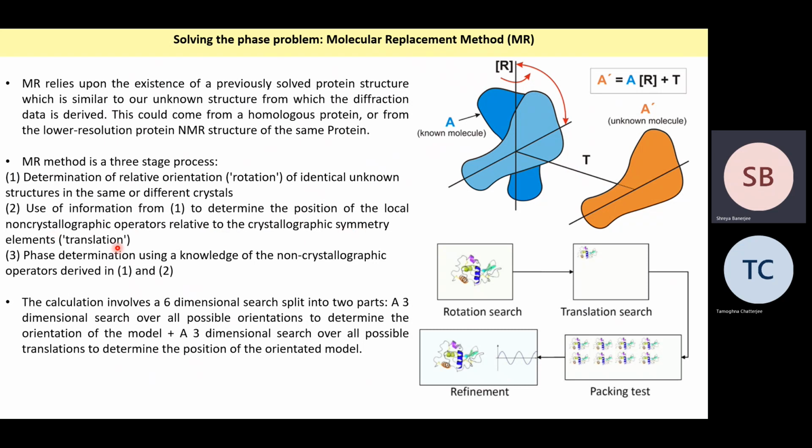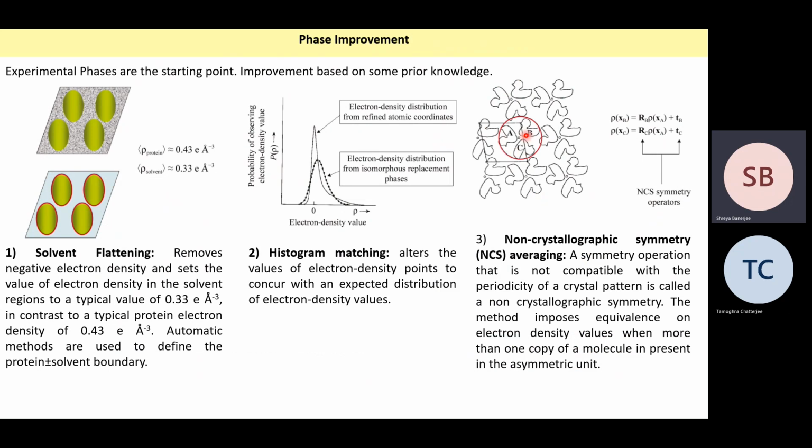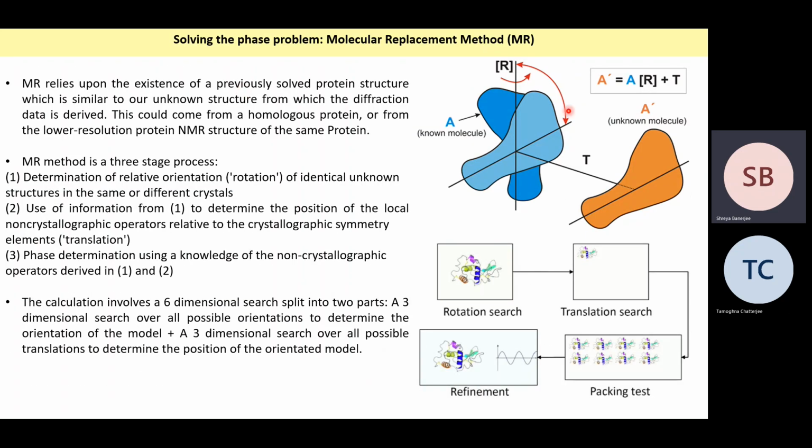The second part is to find any translational operators to find the neighboring elements, like I had talked about, that from one duck in A, you can find B and C by translation. So once you know the structure of this, by translation or T, you can find the structure of neighboring non-crystallographic elements. So using this, you can find the phase of your unknown protein.